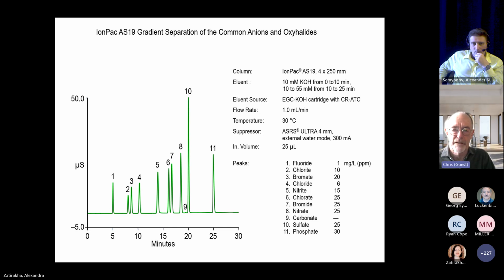And so if you just treat the resin with the diepoxide and then rinse away the excess diepoxide and treat it with amine, if it's a primary amine, then it will leave a pendant secondary amine group that will react with 2 diepoxides if you treat it a second time with diepoxide. And because of that fact that you have a doubling of the number of reactive ends with every reaction cycle, you can get a geometric increase in capacity by repeating the process over and over again.